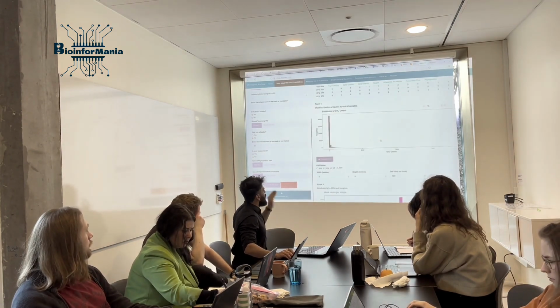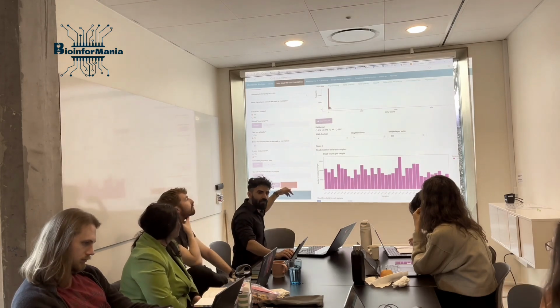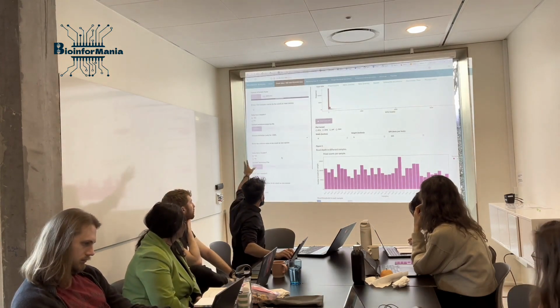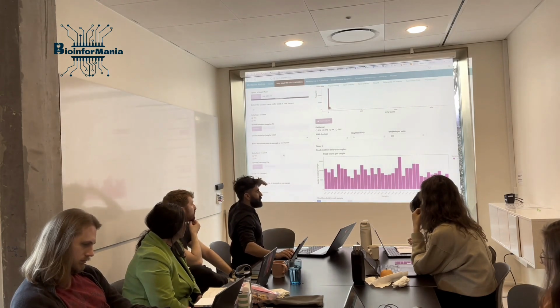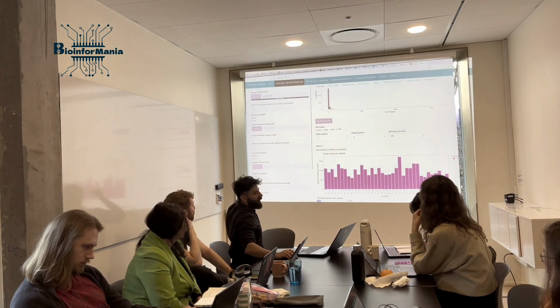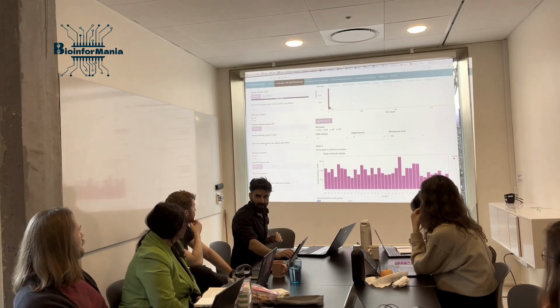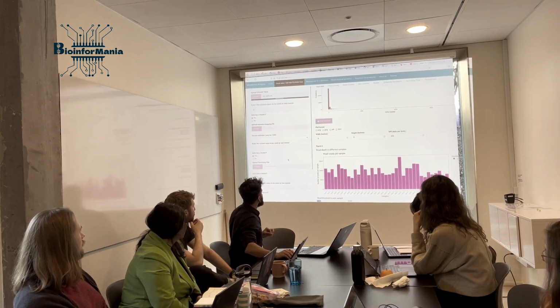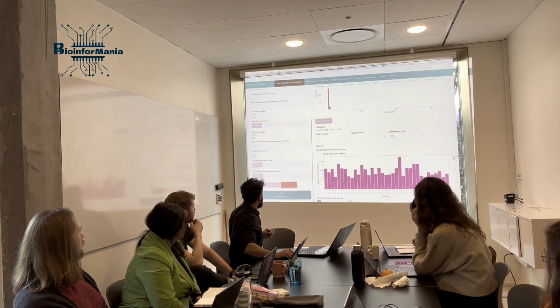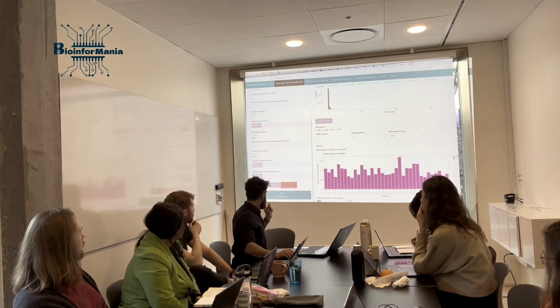But anyways, now we don't do that. You know how to load your own data. If you have filled this form, okay, this form is necessary to have, requires you to have one OTU table, one metadata, one taxonomy table. Necessary, okay? The rest is optional. And then again, you collect data, okay? Load test data is only for this demonstration purposes. Your own real world data is collect data.